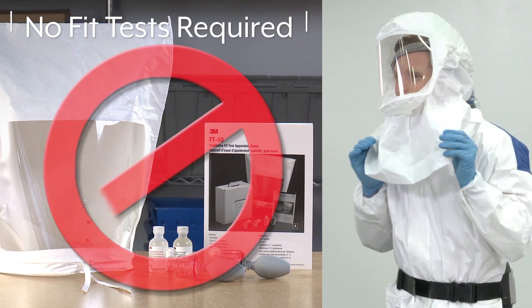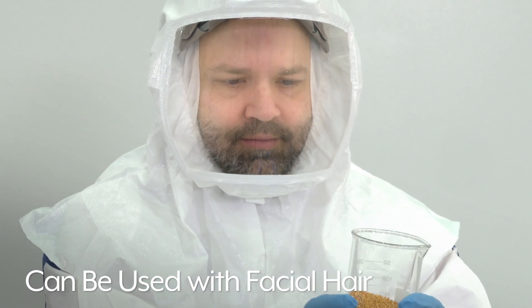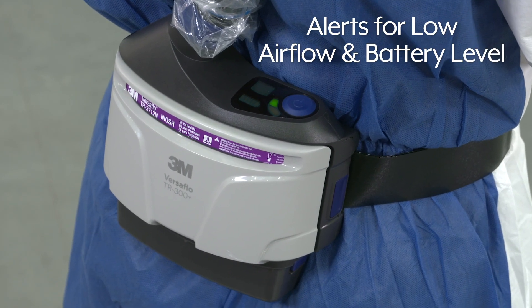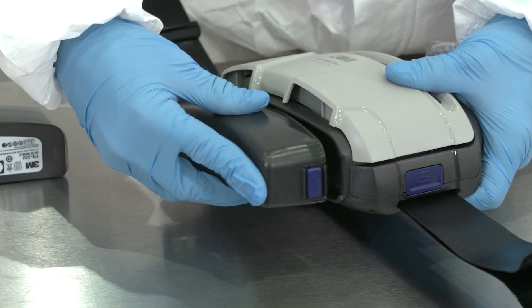Additionally, the system doesn't require fit tests and can be used with facial hair. Audible and visual alerts for low airflow and battery levels notify you when it's time to change the filter or battery.